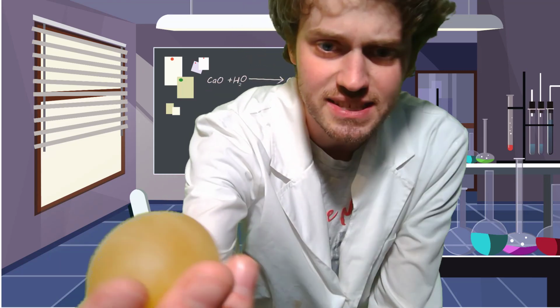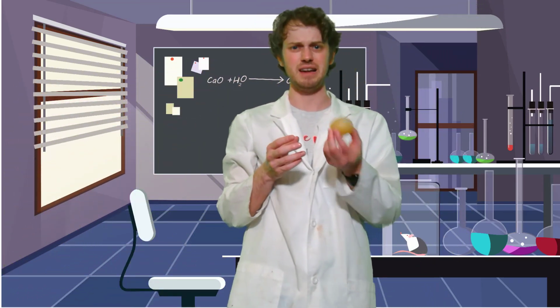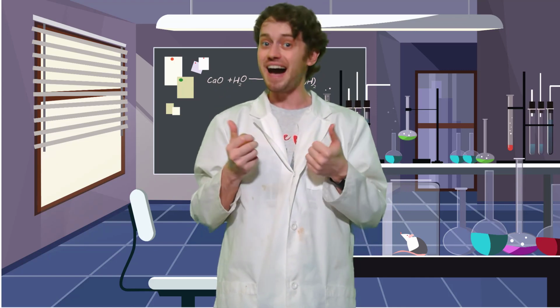And you can see it's still pretty squishy. I honestly probably could leave it in there for longer, but I got a little bit impatient. And so that is the experiment. I do want you to consider this experiment when we are talking about osmosis, and think about how it relates to words like hypotonic and hypertonic and isotonic. All right, bye everybody.